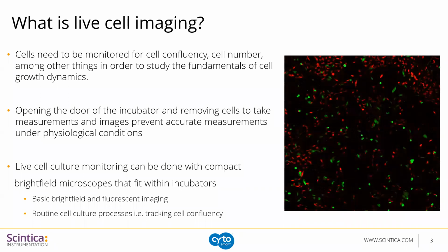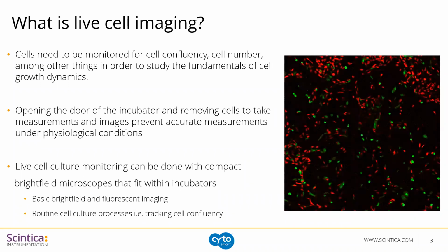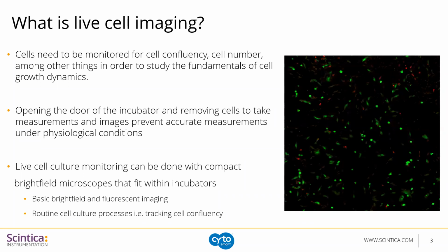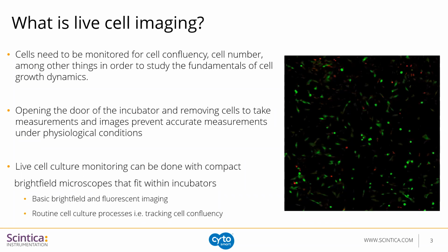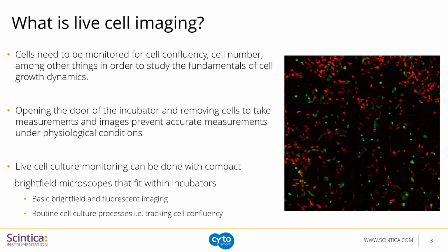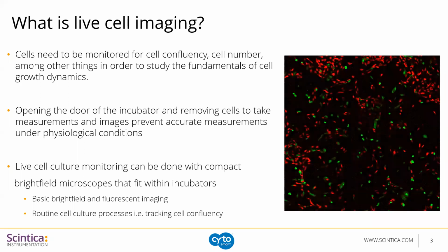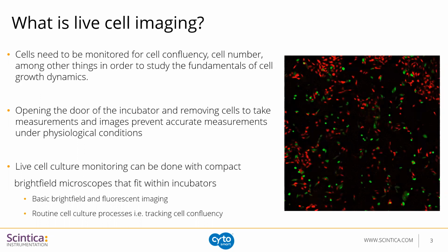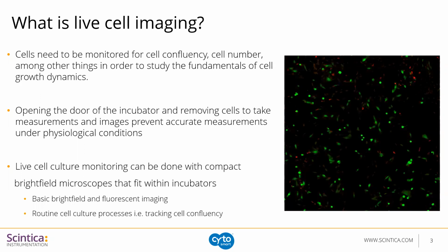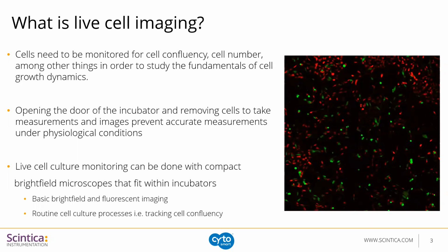Now, both CO2 and tri-gas incubators are designed to generate and maintain a certain environment, and they do a great job of imitating physiological conditions so that cells can grow in their ideal environment. The problem really lies in the frequency of the door of these chambers being opened when cells are removed from the environment every time a measurement is made or an image is taken. And this is usually done with an external microscope.